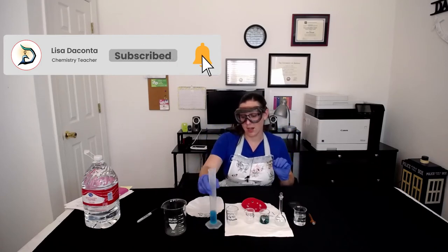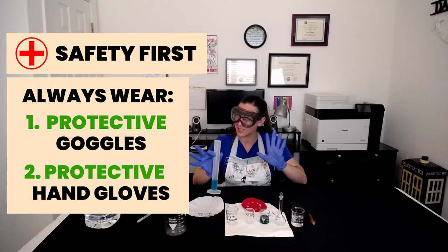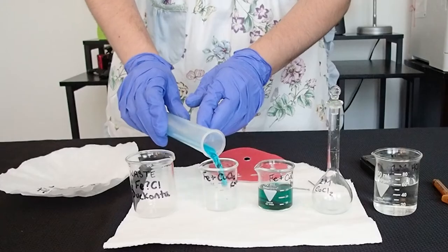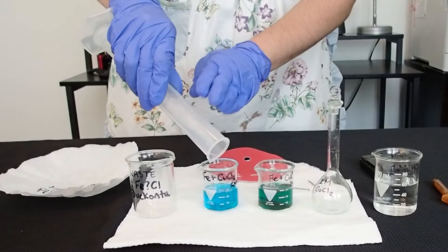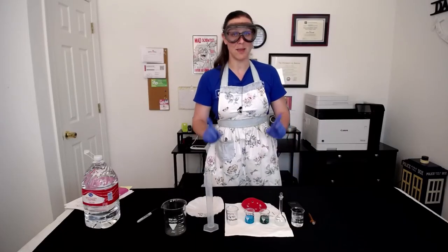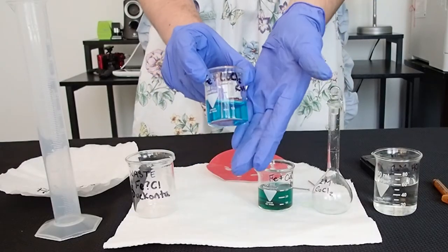Notice that I am wearing goggles and gloves for this experiment because we don't want to get copper chloride on our skin or in our eyes. Likewise, we're using one molar HCl hydrochloric acid, which we also don't want in our eyeballs or on our skin. Now let's pour this 25 milliliters of our copper chloride solution into our reaction vessel. Notice that everything I have here on my table setup is labeled — my iron and copper chloride beaker is even labeled as my reaction beaker.